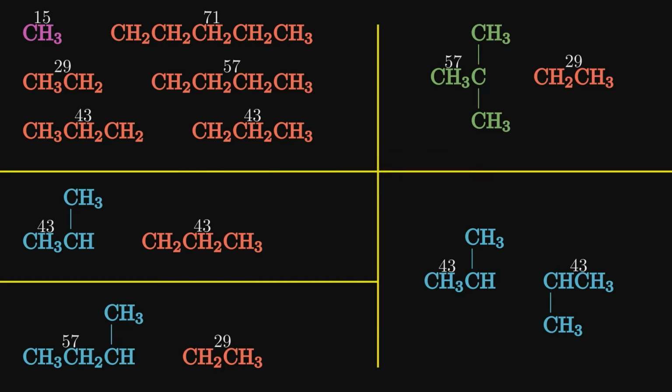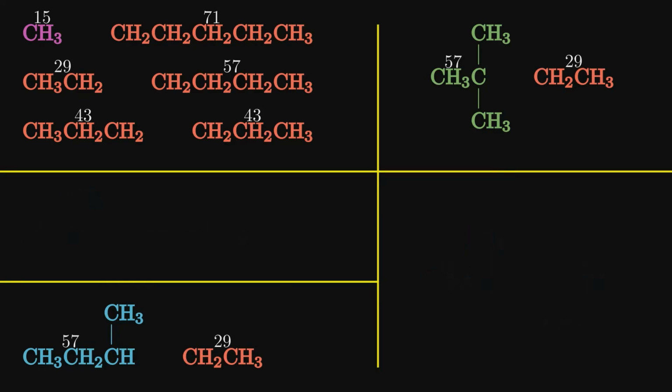Remember that the largest peak, and therefore most likely fragment produced, was at mass 57. The most stable fragments of 2,3-dimethylbutane and 2-methylpentane have masses of 43, which means on their spectra we would expect the largest peak to be at 43, so we can eliminate these from contention.